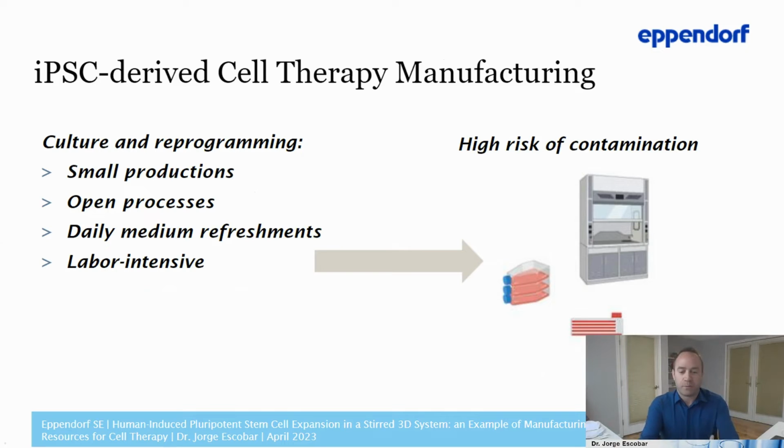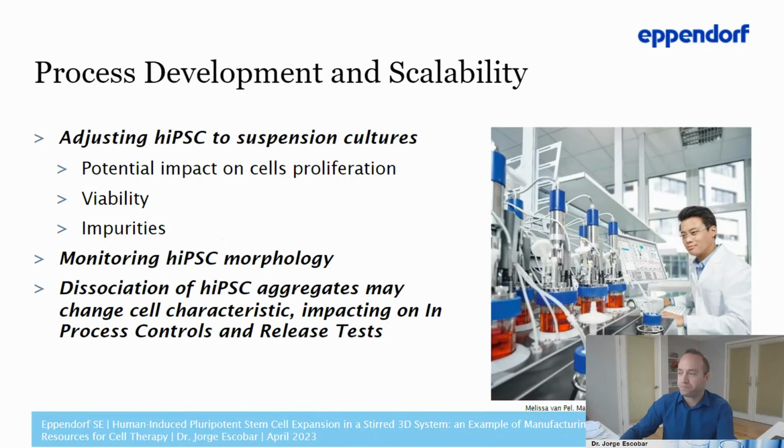The manufacturing process of iPSCs nowadays, including the preculture and reprogramming, is a labor-intensive and open procedure which needs a lot of daily manipulation, including medium refreshment. This is a situation with a high risk of contamination, and we should avoid that.